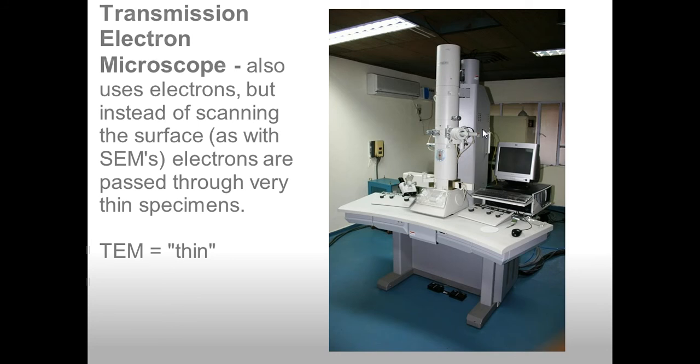This electron microscope is a little bit different. It's called a transmission electron microscope, or TEM. It also uses electrons, but instead of scanning the surface, as the SEM does, the electrons are passed through very thin specimens. So to remember TEM, think thin.